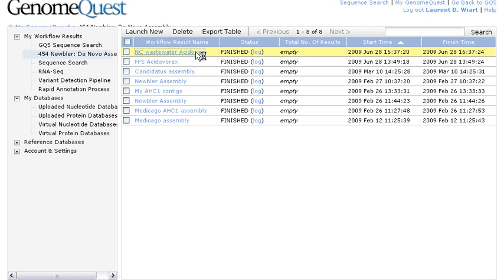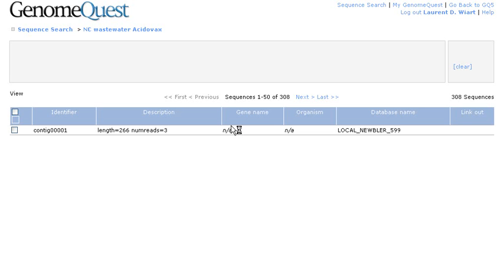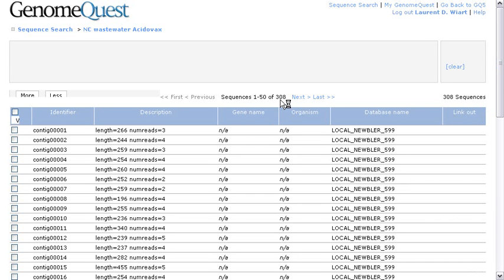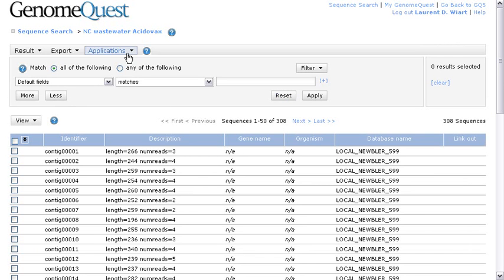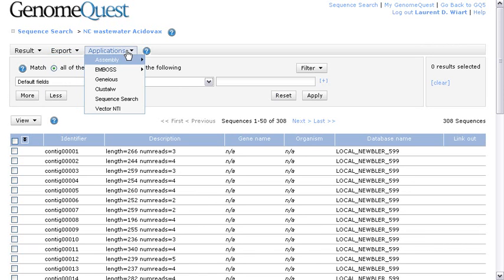I could click on this link to access those contigs. Now, we can see that with those default parameters slightly changed, we have 9% of the reads assembled, and we could decide to browse this database of contigs to keep working on them. Now, we can see a few contigs, about 300 contigs, which are longer than the original sequences. And now we could decide to export them to reports, Word, Excel reports, or even launch other applications.